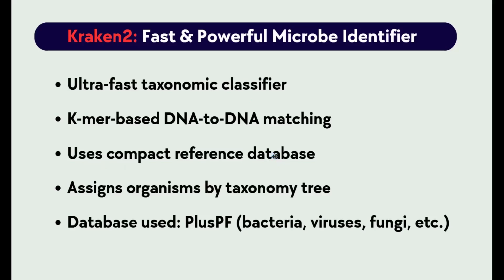Imagine that instead of saying, let me search the entire database to see if this DNA piece exists, your computer says, I know exactly where that piece should be. Let me check. This way is much faster. There is no need to use supercomputers to handle huge databases because it is in a compact hash table format.